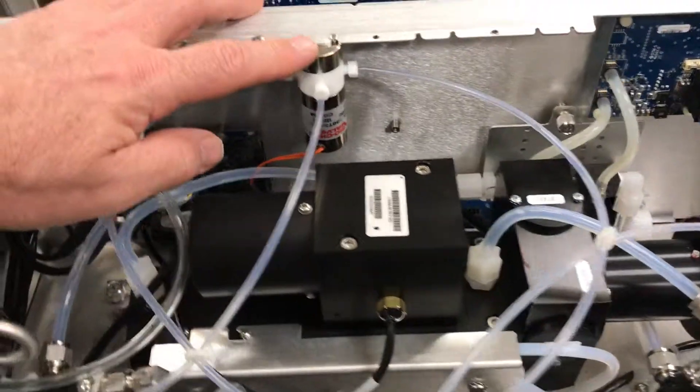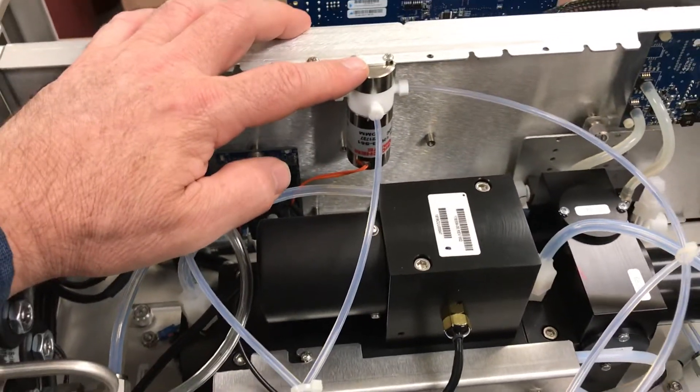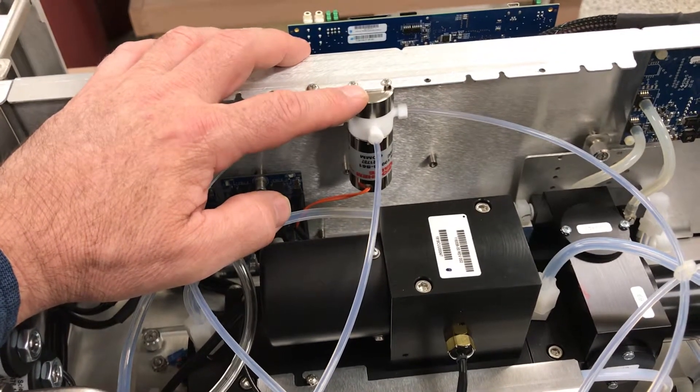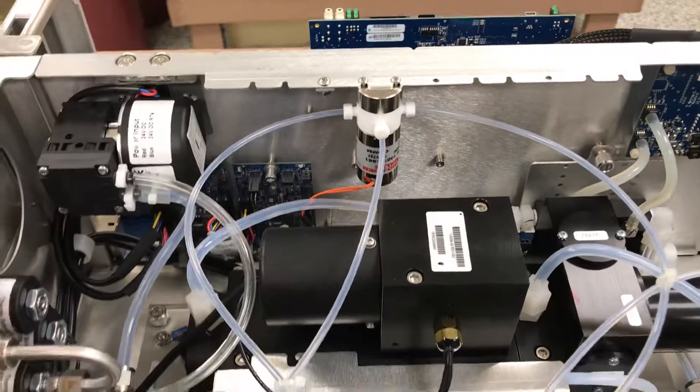There's a solenoid valve for switching if you're working in H2S-only mode, H2S/SO2 mode, or combined sulfur (CS) mode.